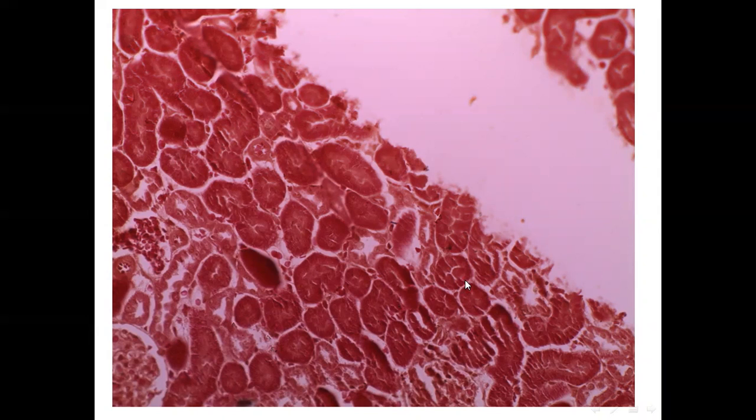Inside each cell of the kidney tubule, we know that the kidney tubule is lined by what? Simple cuboidal epithelium. The cells appear pyramidal in shape. Inside each cell, there is what? There are mitochondria, cytoplasmic inclusions. Inside each kidney tubule cell, there are mitochondria, appearing as rods.